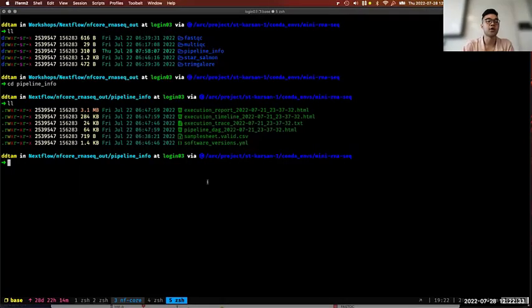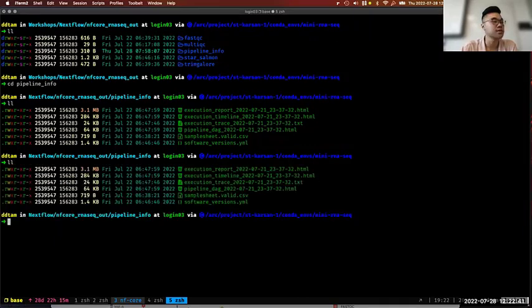Oh, you don't see the report? Are you looking inside pipeline_info there? Did anybody else try to look? There should be 3 HTMLs, a trace, and then your sample sheet CSV. Maybe your run failed, or we hit a file limit quota again.